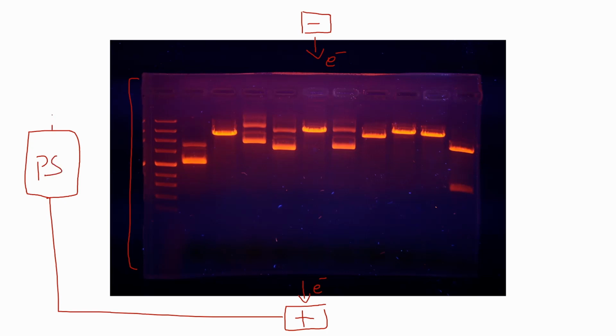You'll have a full circuit whereby the electrons can move and create an electrical field. So the electrical field is running across the gel, and this electrical field will drive the movement of electrons as well as the movement of your molecules or samples which contain the molecules of interest.